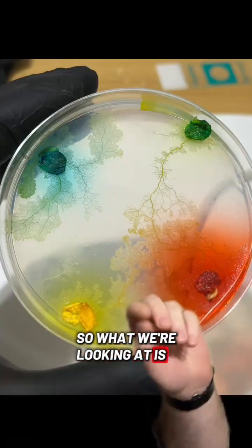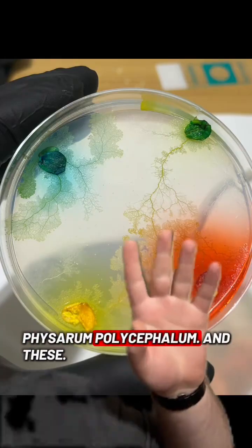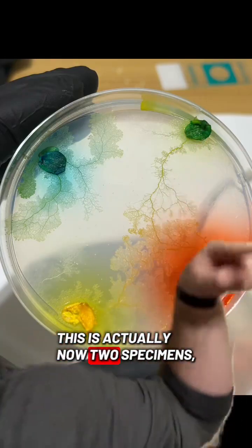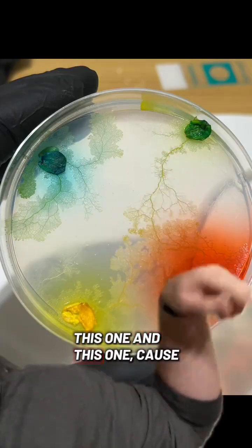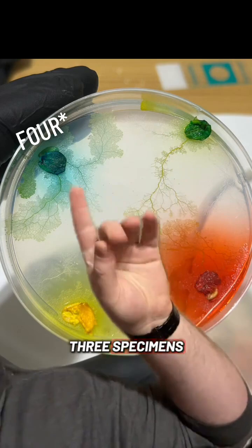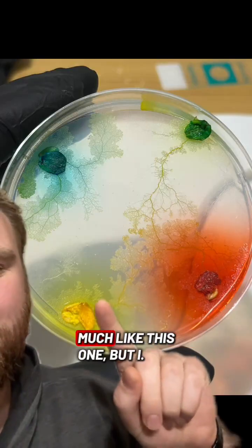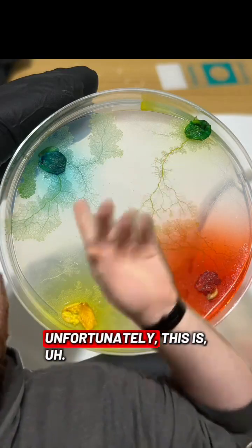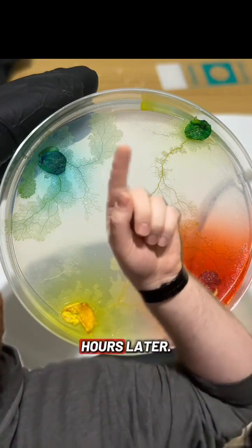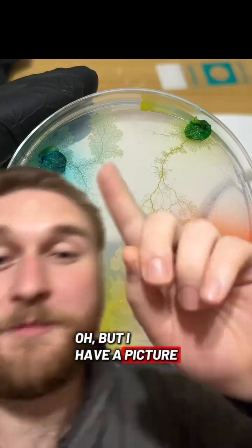So what we're looking at is this plate of this slime mold, Physarum polycephalum, and this is actually now two specimens, this one and this one, because these three fused, but it started out as these three specimens that had taken up different colors of dye. They're usually yellow, much like this one. But unfortunately, this is that plate a few hours later. This is not exactly the specimen we were looking at because, oh, but I have a picture of that one.